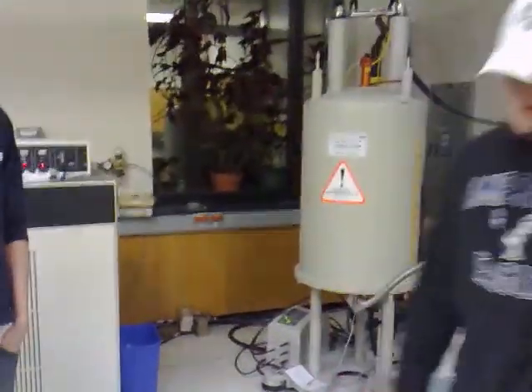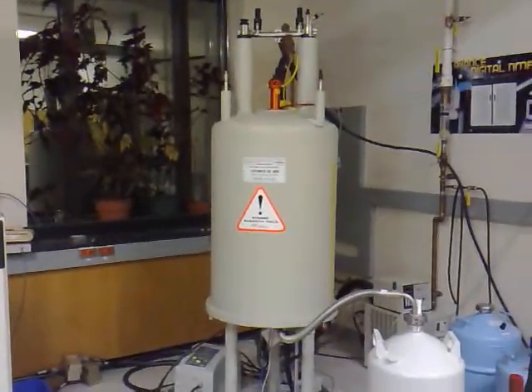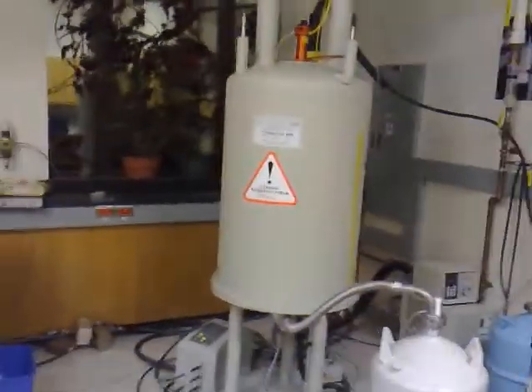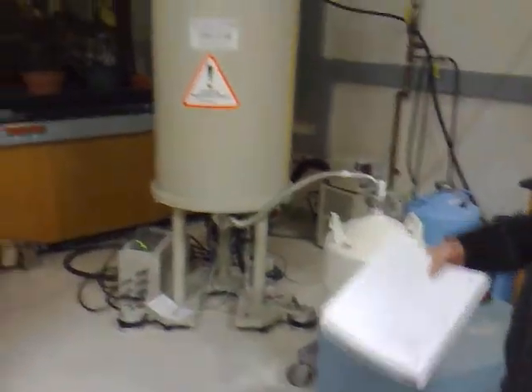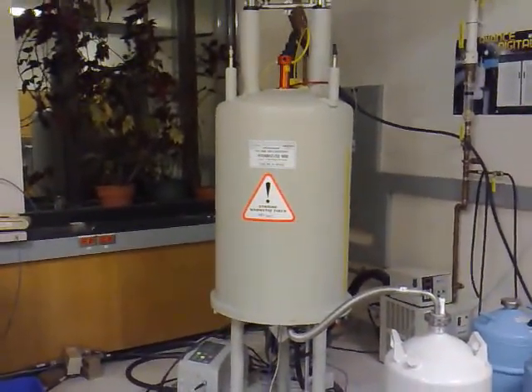Iowa State University NMR — nuclear magnetic resonance. This right here is one of the instruments. It's a 400 megahertz NMR magnet, so that's a giant superconducting magnet. They keep the magnet stable with liquid nitrogen and liquid helium to keep it cold and keep it superconducting.